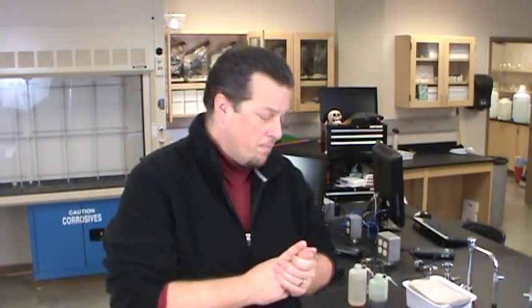Whenever we're looking at the color of a substance, the color that we observe is really an interaction between light and some sort of molecule. Depending on how the light and the molecule interact, we observe different colors. So there are a couple of things that will affect that. First of all, it's just the nature of the molecule. That makes sense. If something is red, it's red. But there are a few other things that we need to monitor, that we need to keep track of.